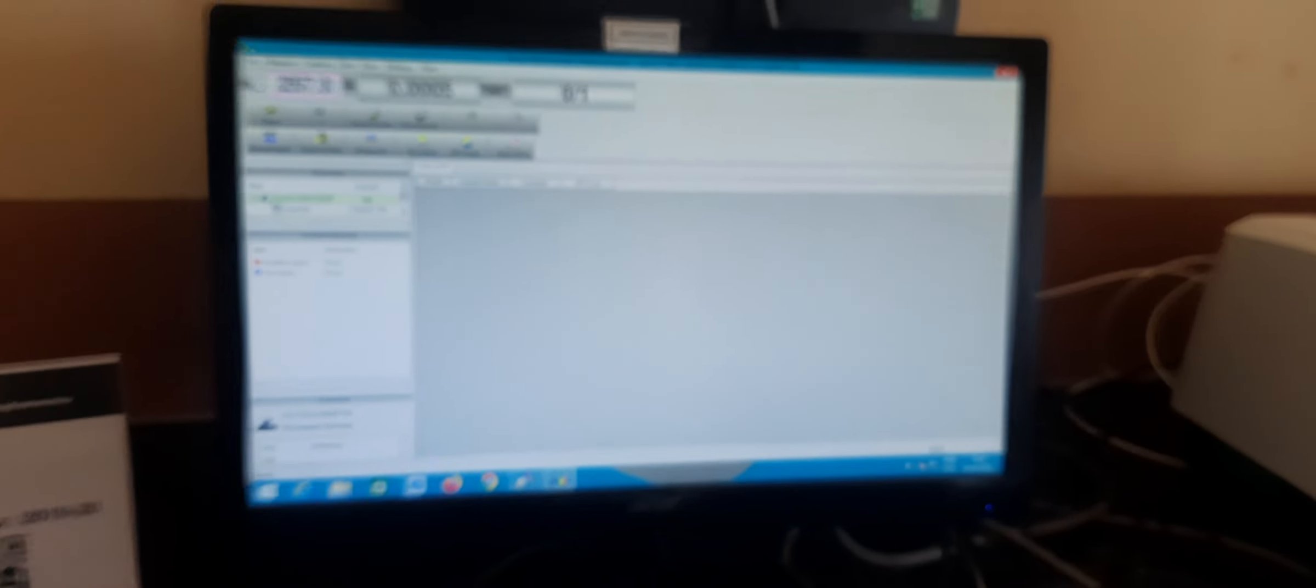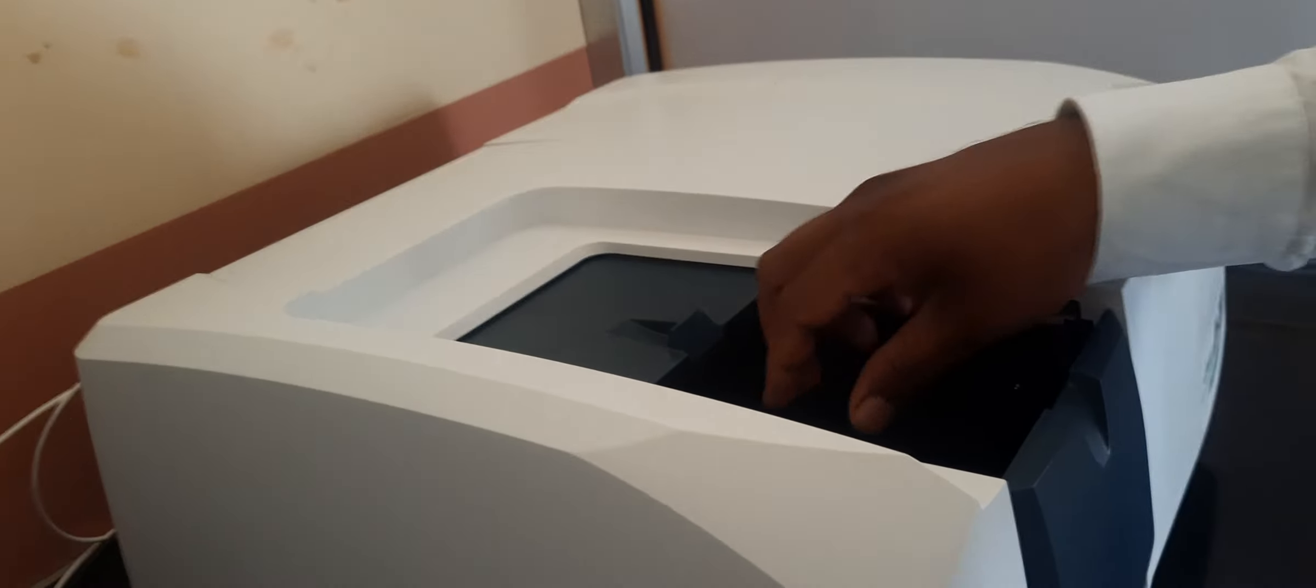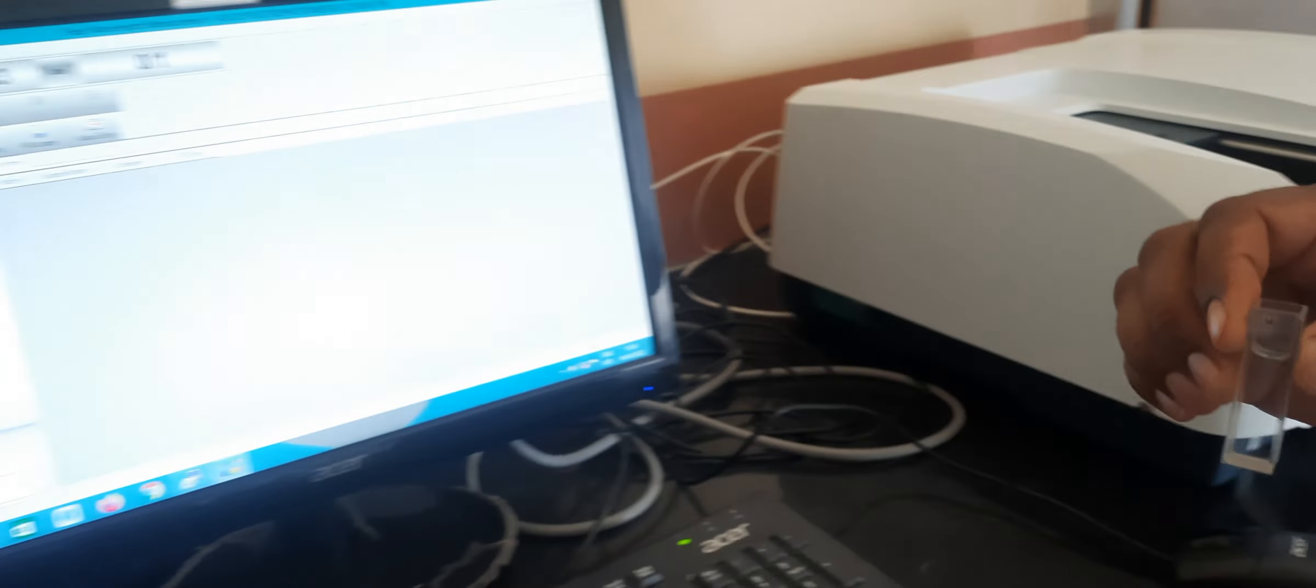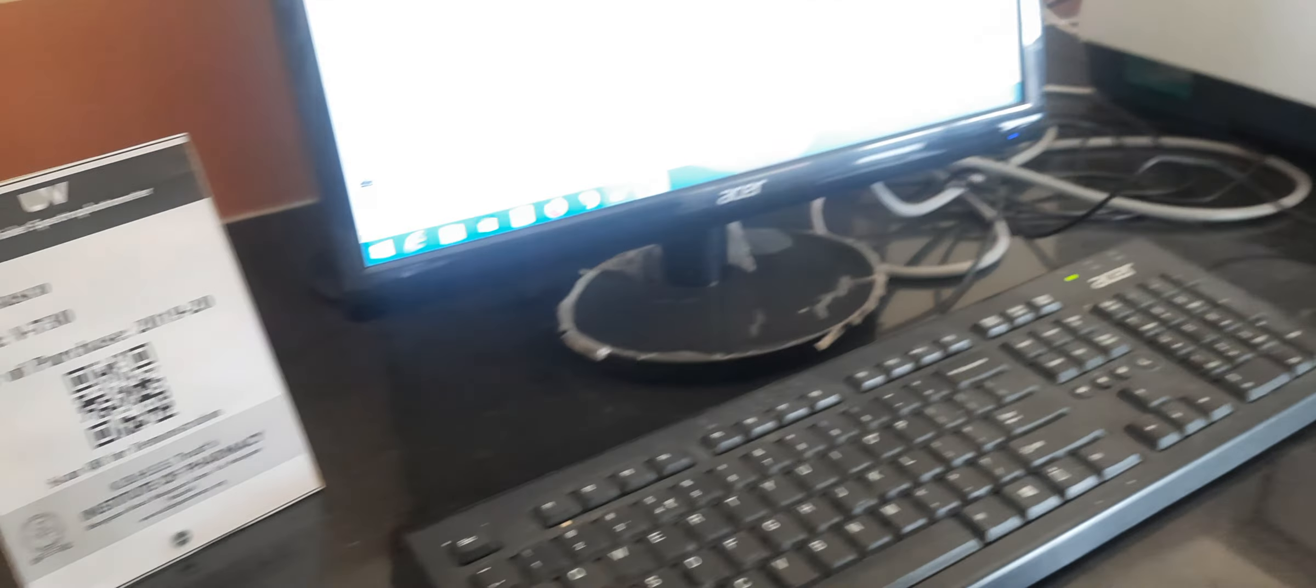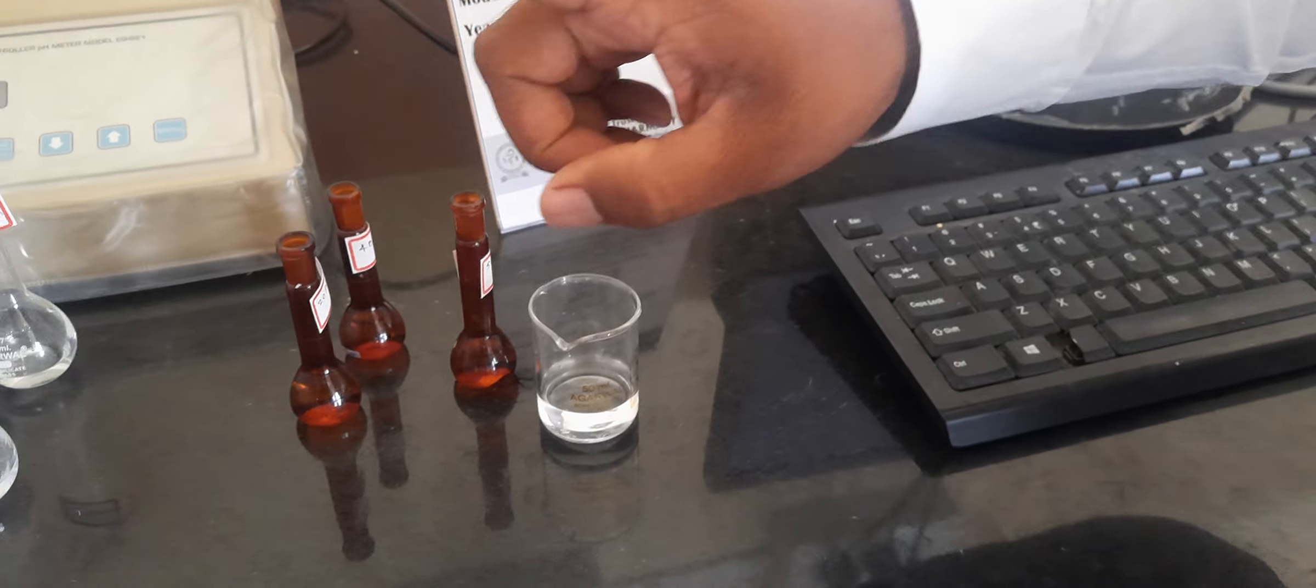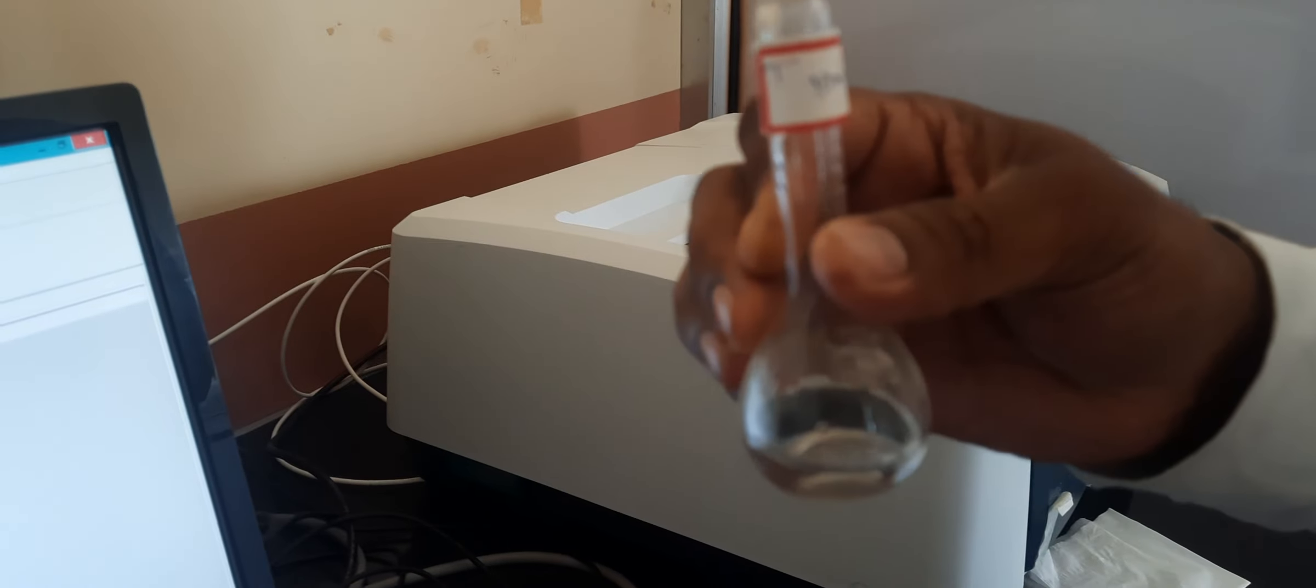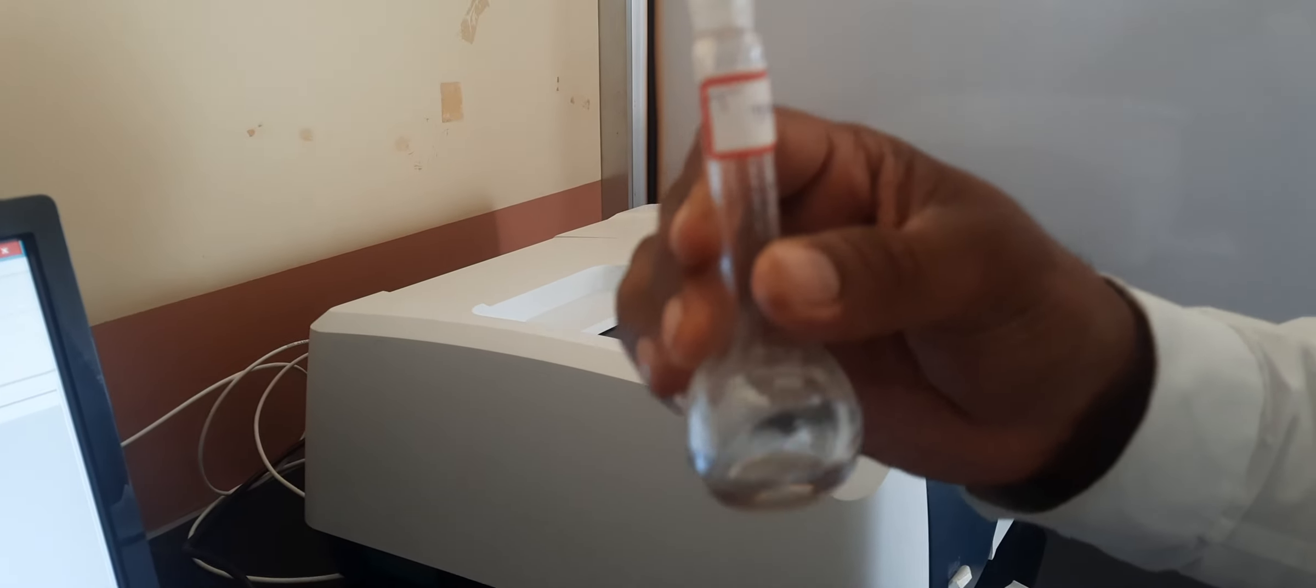Now place our dilution samples, or PPM solutions, in the cuvette. Here I'm taking the 10-minute sample which I have taken from the dissolution test.